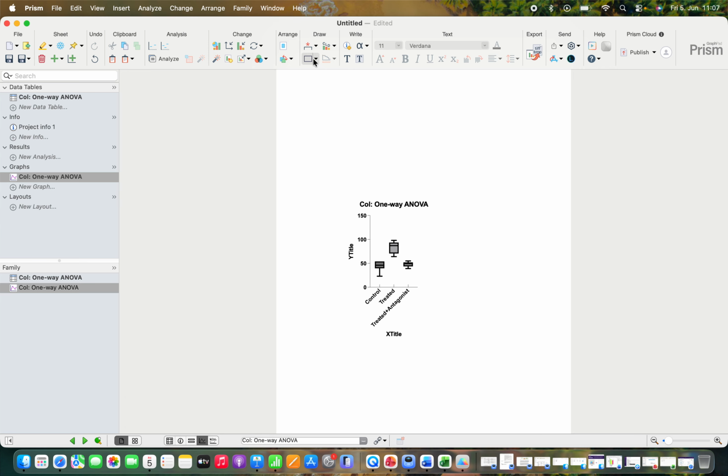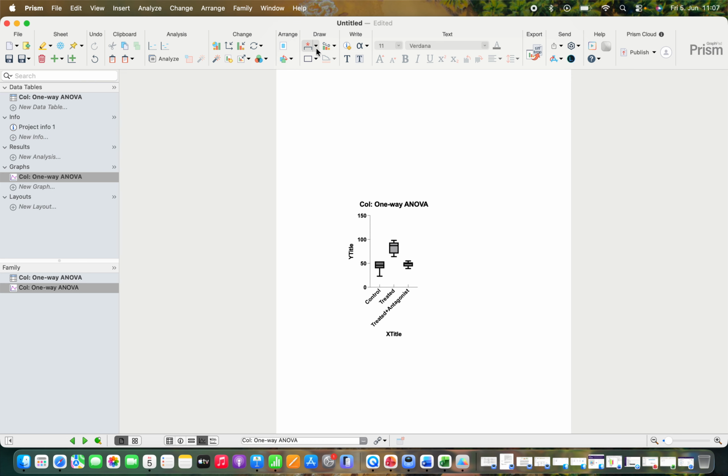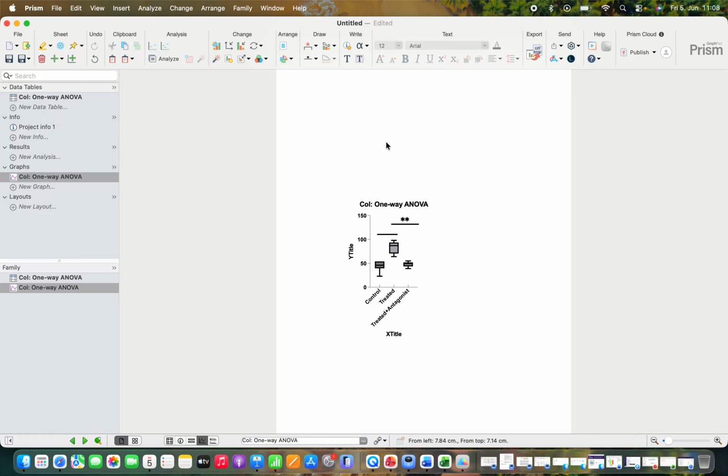Okay, and what about this axis, it is to draw. For example, I want to give it automatically add pairs comparison, it will automatically add pairs comparison, or different lines you can do manually like this. For example, this way you can tick here, different colors, automatically add compact letter display. Okay, this one if you want to show significance, stars. For example, you can click in this way.